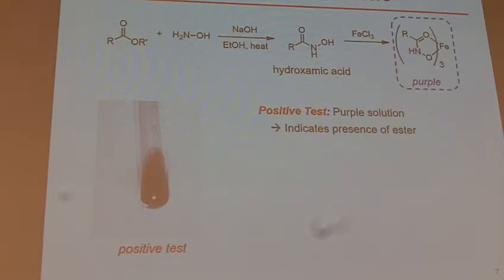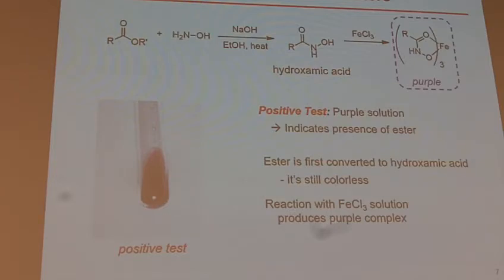After this test, there isn't any more necessarily chemical tests that we would do in the flowchart. The next step is we want to decide if we have a carboxylic acid or not, okay? So if you're negative for an ester, then you go down and you're trying to figure out if you have a possible carboxylic acid. The way you test for that is your solubility test in sodium hydroxide. And so you're just looking to see if it's soluble in sodium hydroxide or not. If it's soluble, then most likely you have a carboxylic acid. If it's not, then we went through everything, got negatives for everything, and that's where we're looking at the ethers, okay? And so then we're done with the chemical testing.